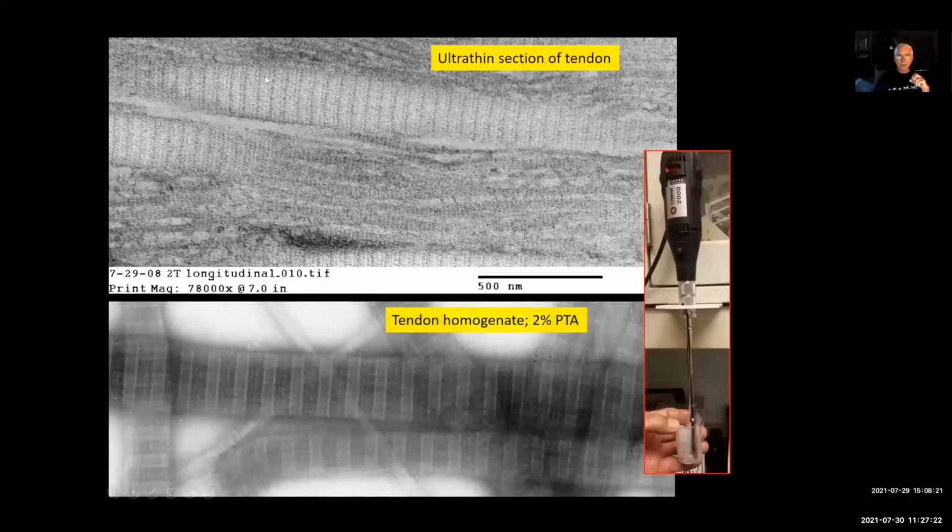I'll also mention regarding, for example, tendon or other collagen fibrils, that when we look at these in fixed and embedded tissue sections cut at 80 or 60 nanometers, we see difficulties in really resolving the structure of these collagen fibrils in those tissue sections. However, if we just do a simple homogenization procedure, cutting a little bit of tendon out of the tissue, grinding it up with a homogenizer in the presence of buffer and ice, importantly ice, we see quite a different field of collagen fibrils.